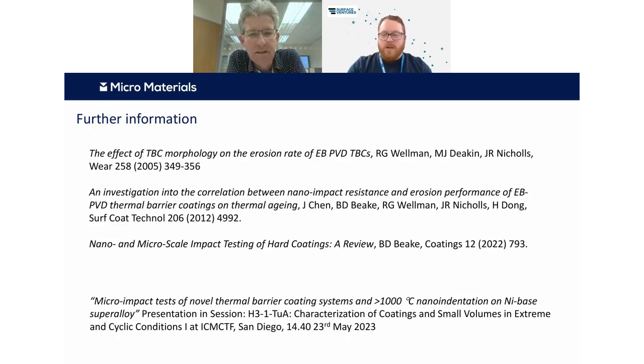Yeah, sure. So there's several things that you could look at, but I think the thing that is simplest in this case is to have an impact volume, essentially. So that impact volume at the end of the test. So you basically, just as you have in an erosion test, have comparative impact volumes as a quantitative metric that says this is the erosion resistance, and that allows you then to directly correlate between different materials when you look under the same set of test conditions.